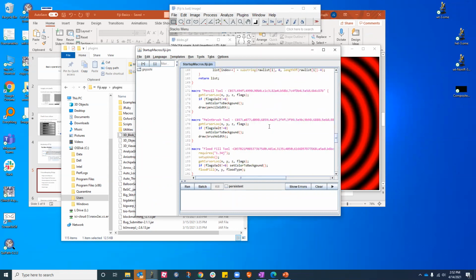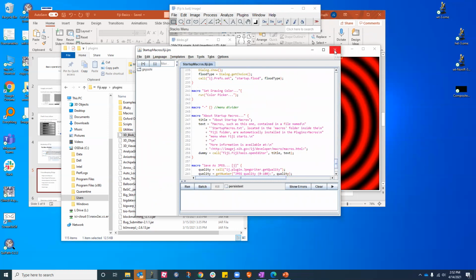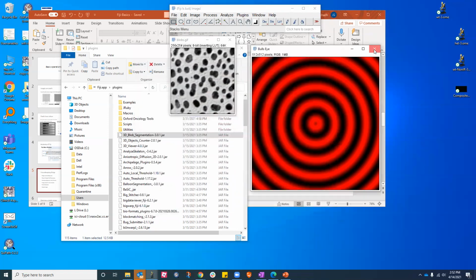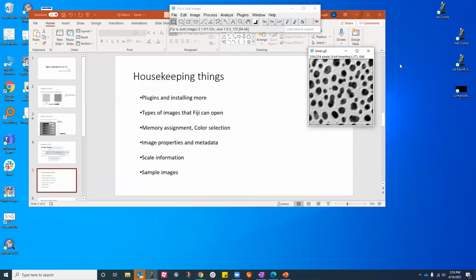So all the plugins are a bunch of codes which does mathematic operation on the image. Okay, and if you are interested in learning more, that's part of a computer vision science course. So if you get too much into this, you can take one of the courses from Georgia Tech on vision sciences, and go on with that. All right, but I will skip all that hardcore stuff.